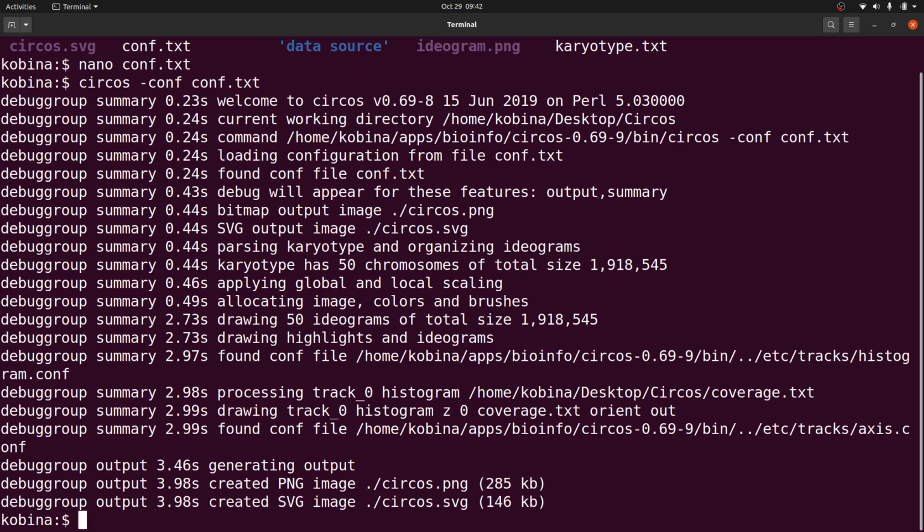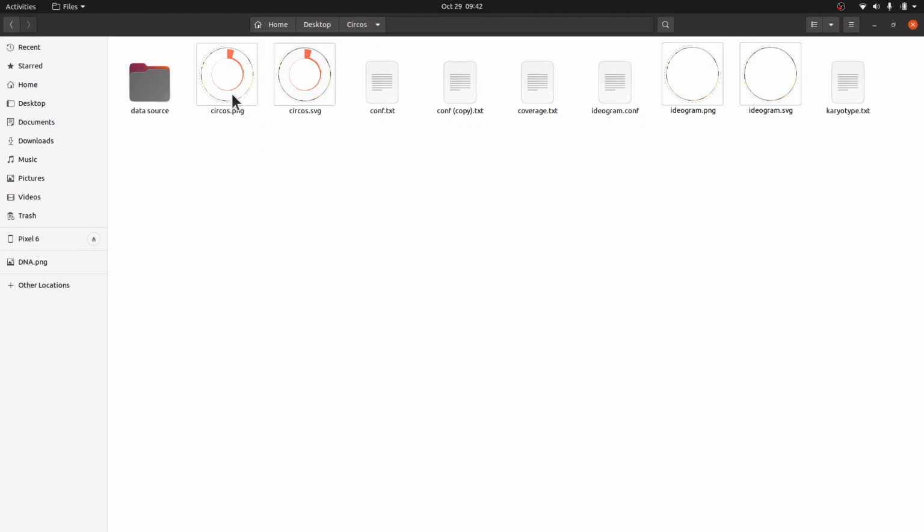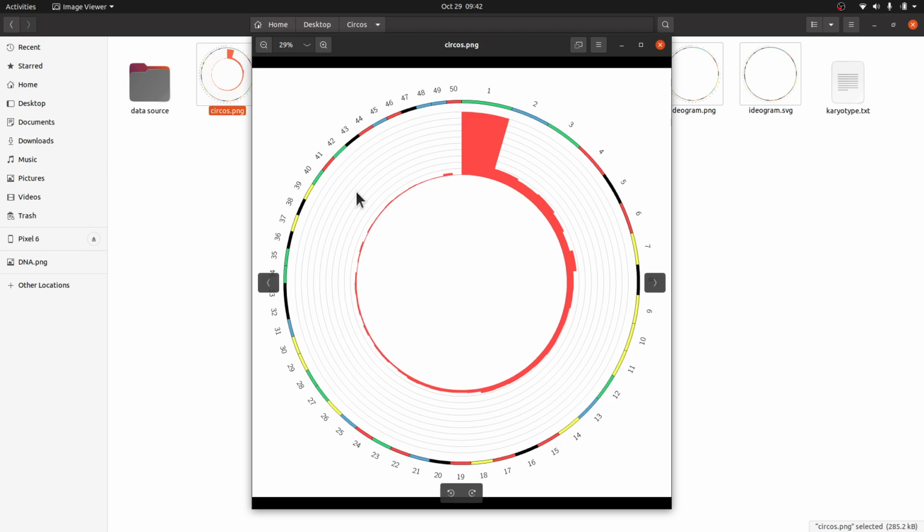Okay, so that has been done. So now when you go back and you open it, you will realize that you have those lines. Okay, so these lines are also important because it makes it visually appealing, and it also makes it easy to do the comparison, right? Unlike the previous one. So this one looks fine. And for the thickness, you can also increase it. That one is up to you. So I'll leave that to you to also do that.